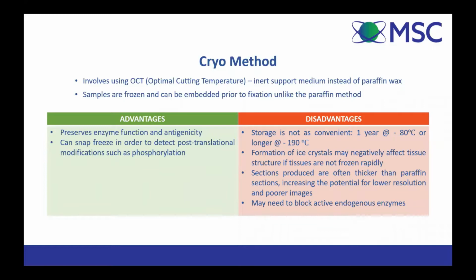This method, obviously, needs a different piece of machinery because everything needs to be cold while you're doing it. With that in mind, if you look at the disadvantages, the storage is not as convenient because you need to keep it for about a year at -80, or you can store it longer at -190 degrees Celsius.